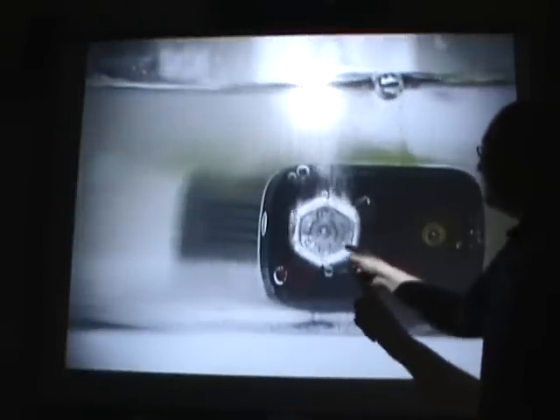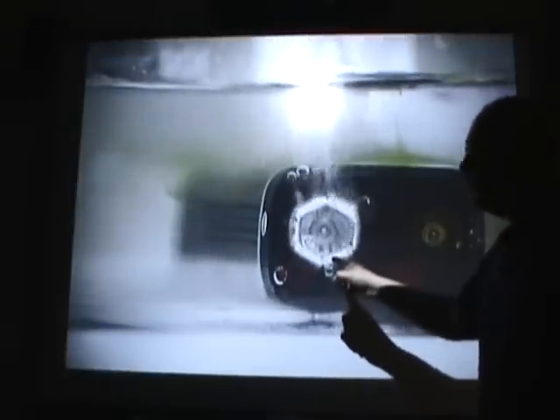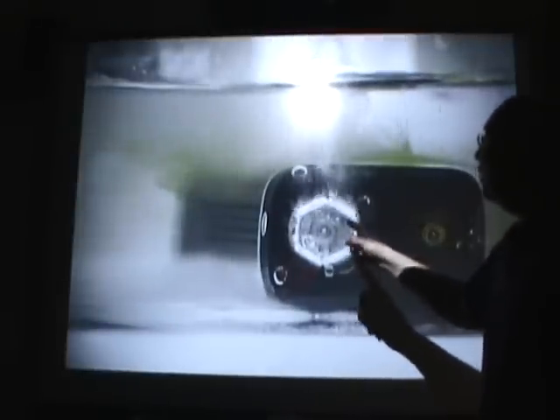Well, as you can see, we're definitely getting hydrogen bubbles. A whole lot of them coming off here. But there's something else coming off of this terminal right here. This yellowish brown goop. What the heck could this possibly be? Oh, that's just wrong. Look at that. It's just brown and yuck. What could that possibly be? Well, that's easy enough to find out.